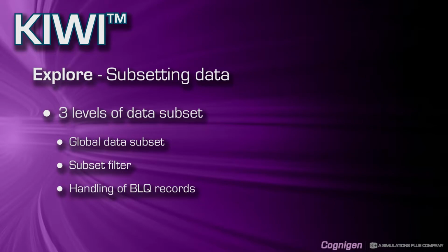Welcome. In this tutorial video, I will describe how you can subset data prior to the creation of EDA displays in the KIWI Explore module. KIWI Explore provides three different methods for subsetting data.